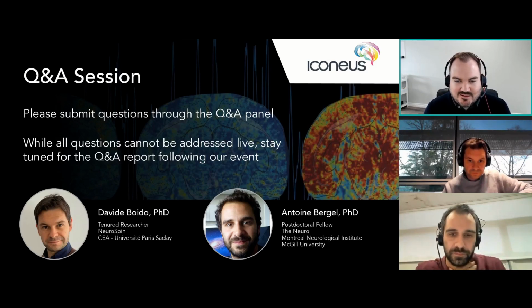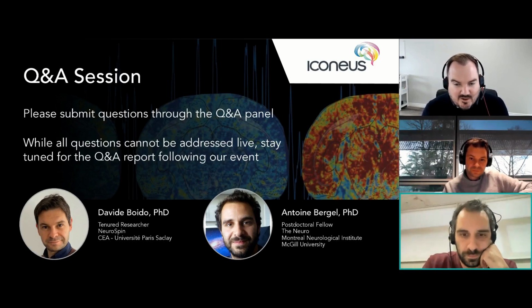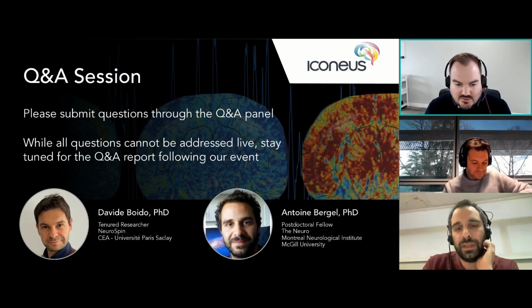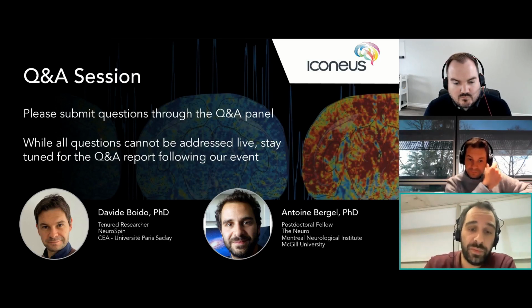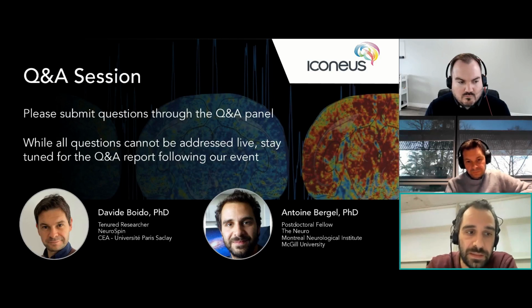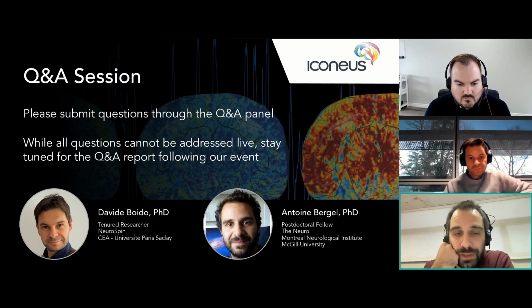Okay, fantastic. And maybe along those lines as well, what is the biggest obstacle to safeguard the implant's integrity for extended periods of time? So maybe weeks, months. That's also an important question, but it's trickier and it's something that everybody in behavioral neuroscience would struggle with. We were actually discussing that with Davide just before the webinar started. So I would say one important thing is, of course, handling and having the animals not being too stressed, and removing whatever is in the cage that could cause trouble to the safety of the implant.